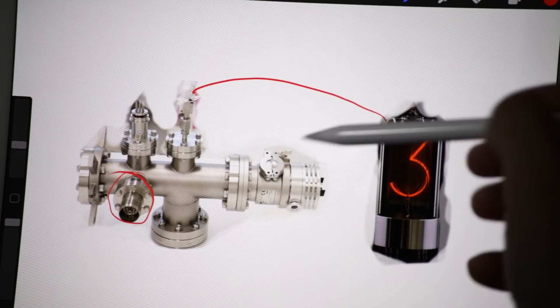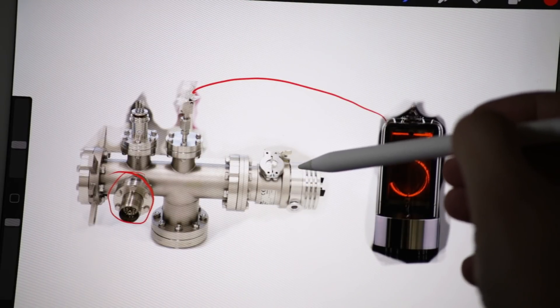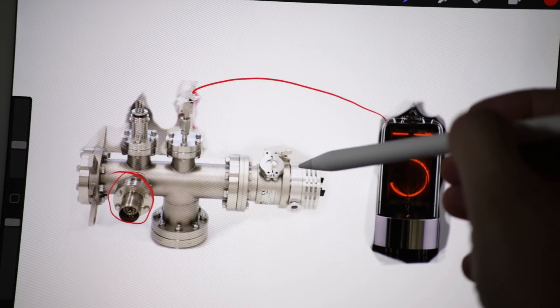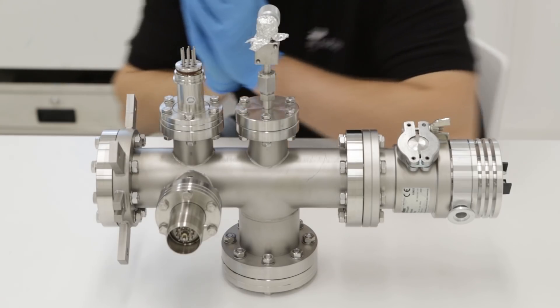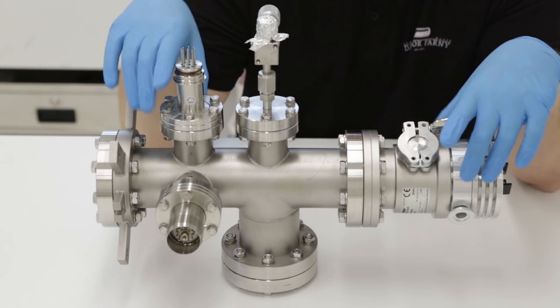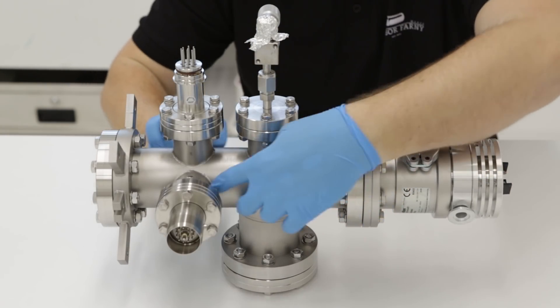For today, I'm planning to fix a leak which I detected here on the turbomolecular pump which will create the vacuum. Here is our chamber, this is the chamber itself.